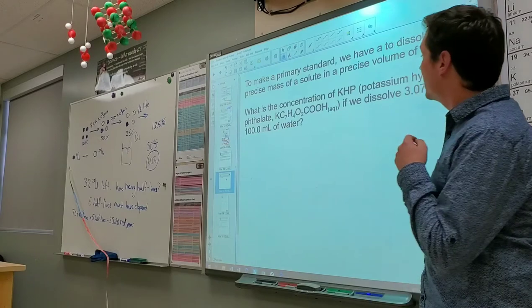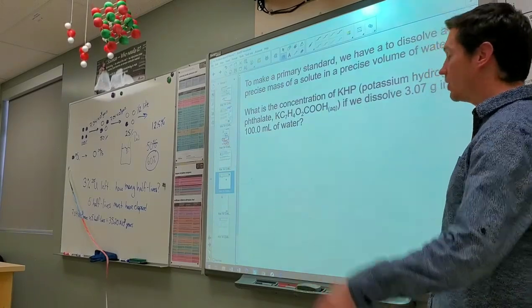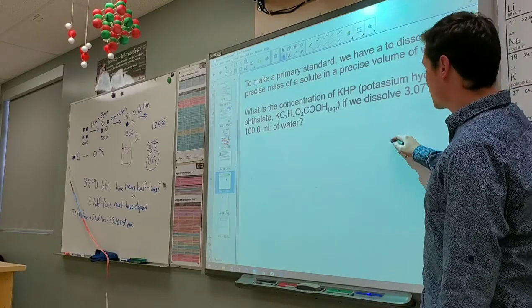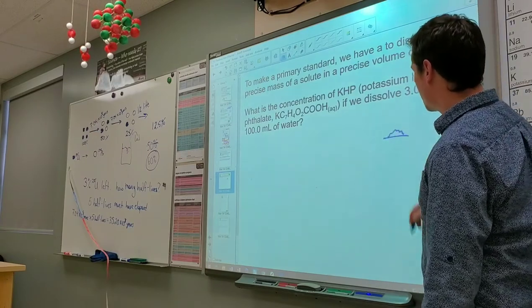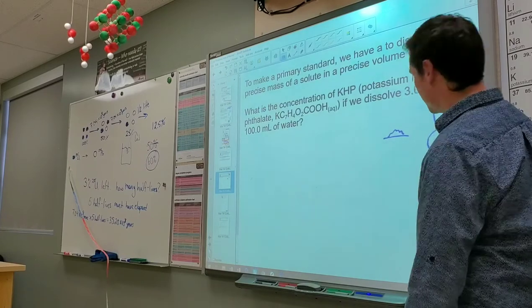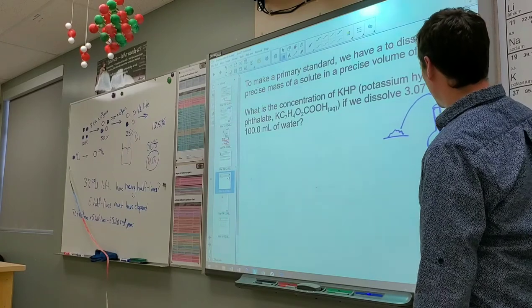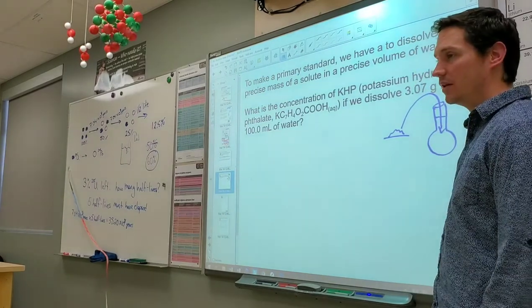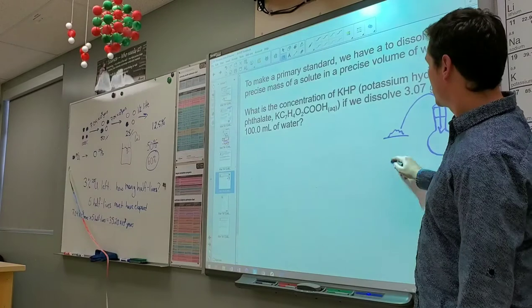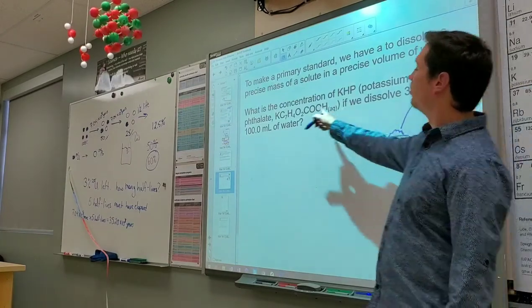To make a primary standard, we have to dissolve a precise mass of solute in a precise volume of water. All you're doing right now is taking some sort of a solid and dissolving it in one of those volumetric flasks. Put this into here, and then fill it up to 100 milliliters. So you know the mass, 3.07 grams. Do you know the molar mass?